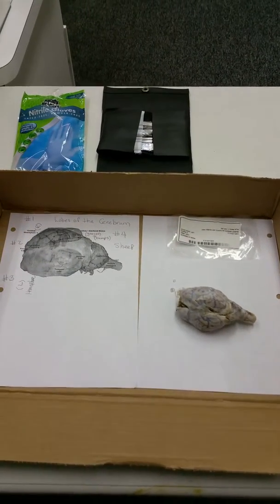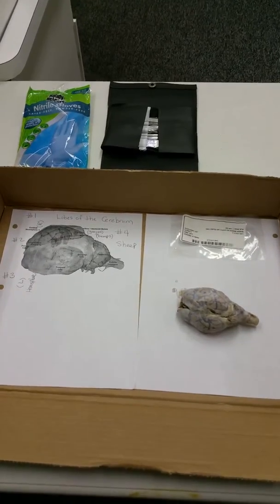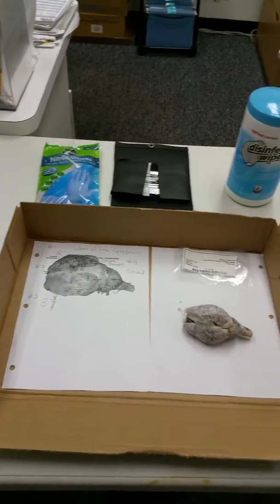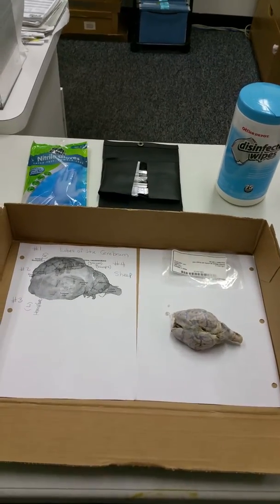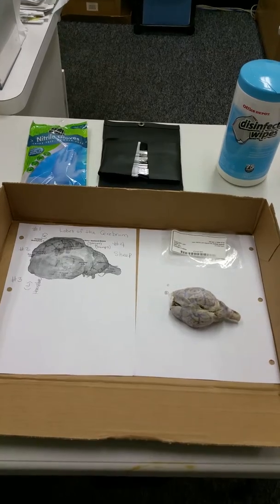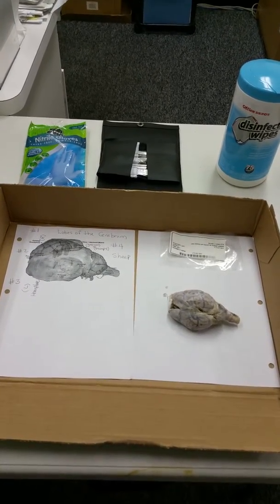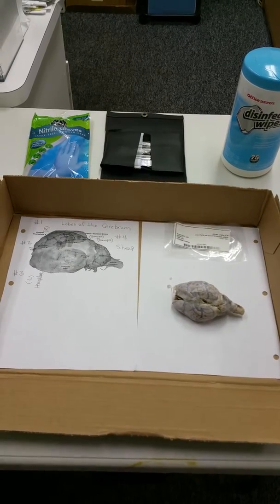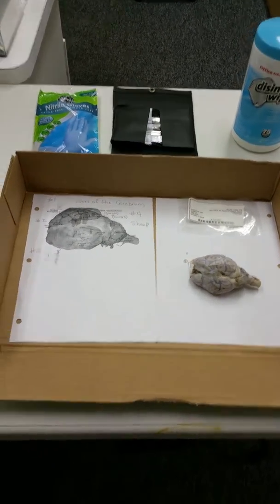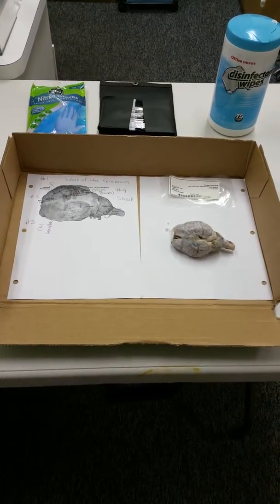What we wanted to do is make sure the environment's clean. So before, we were able to clean the site with the disinfectant wipes. And safety has already been put in place, such as putting on the gloves, making sure the scalpel is always covered. And then in nursing, we always want to make sure that we have a clean surface. And that's what I created here by cleaning the desk and by putting the box top on.